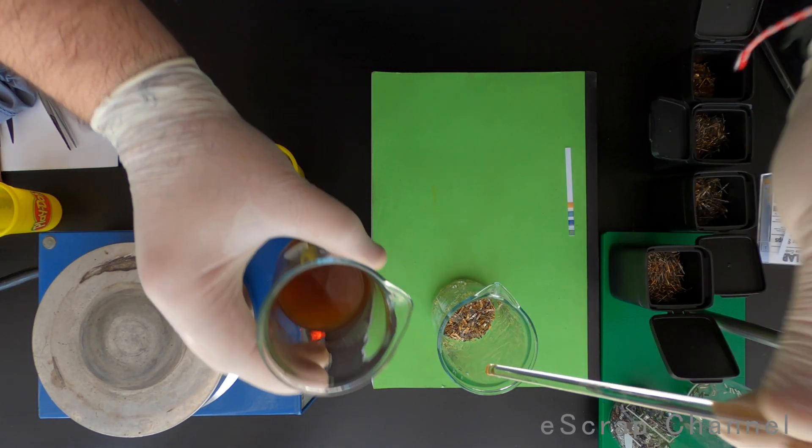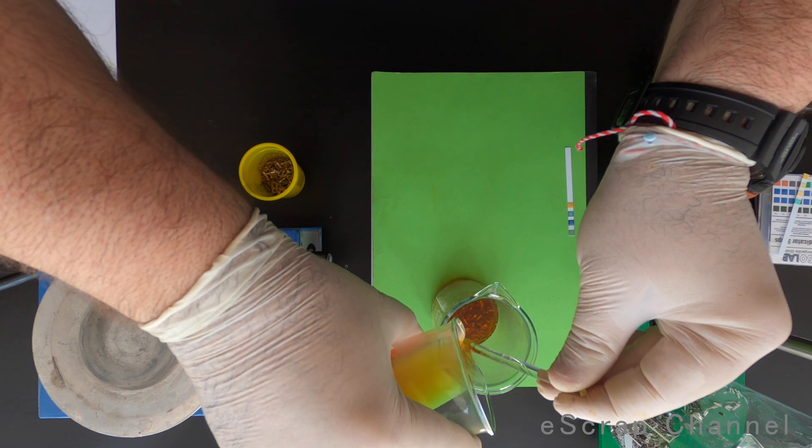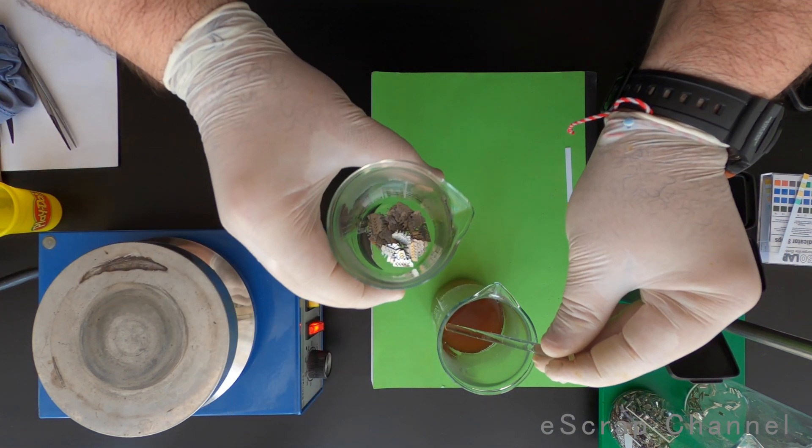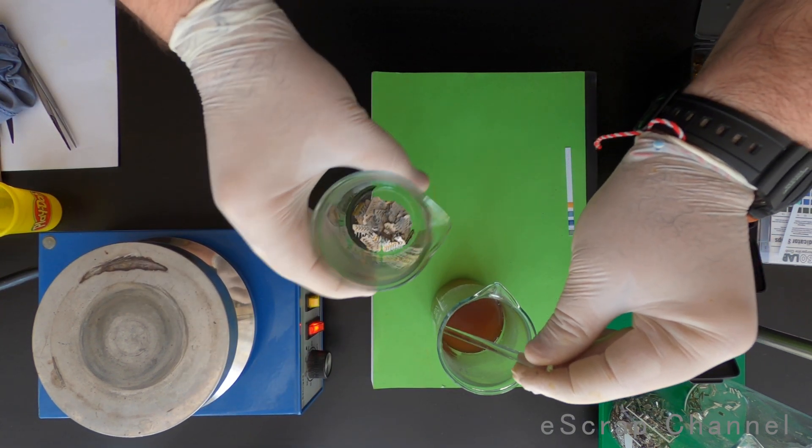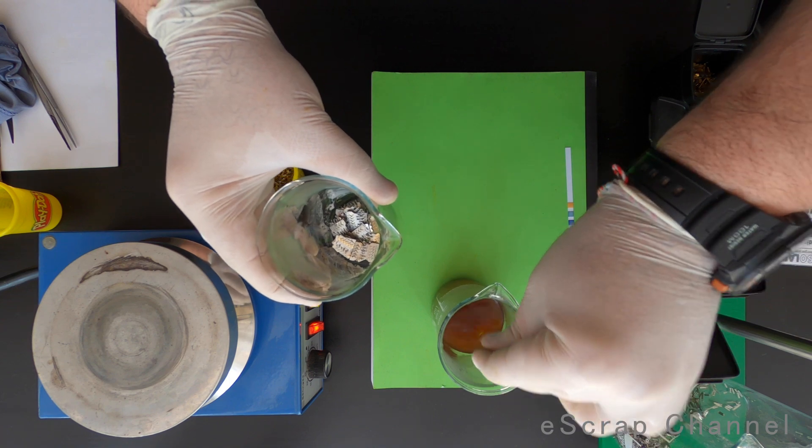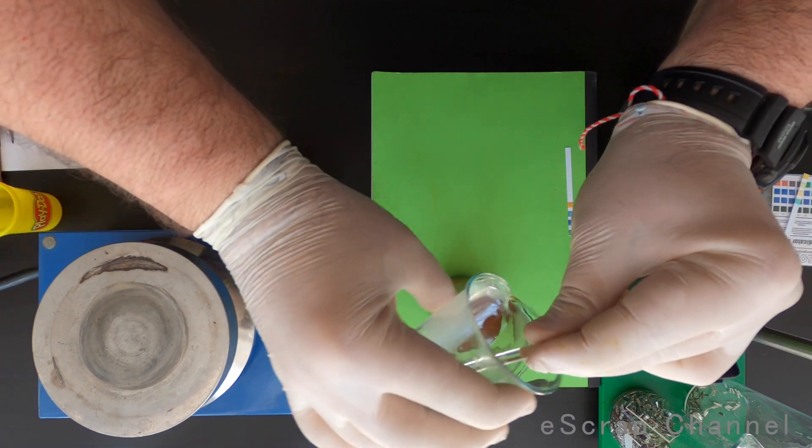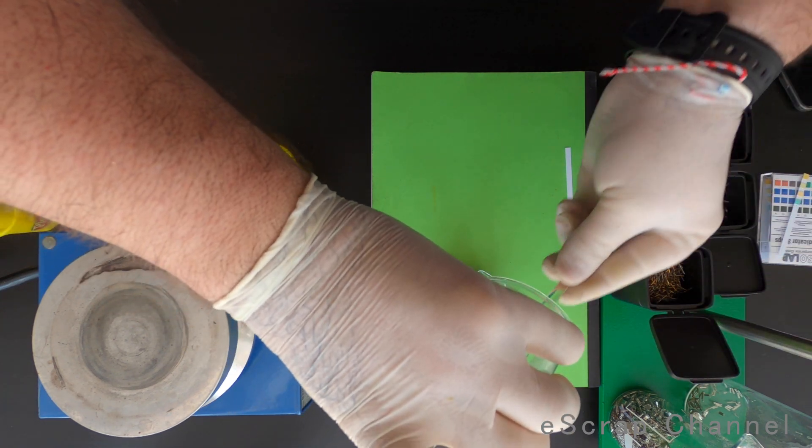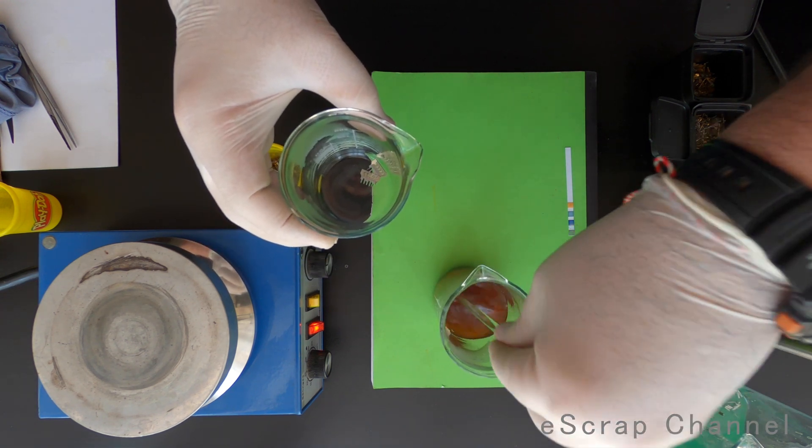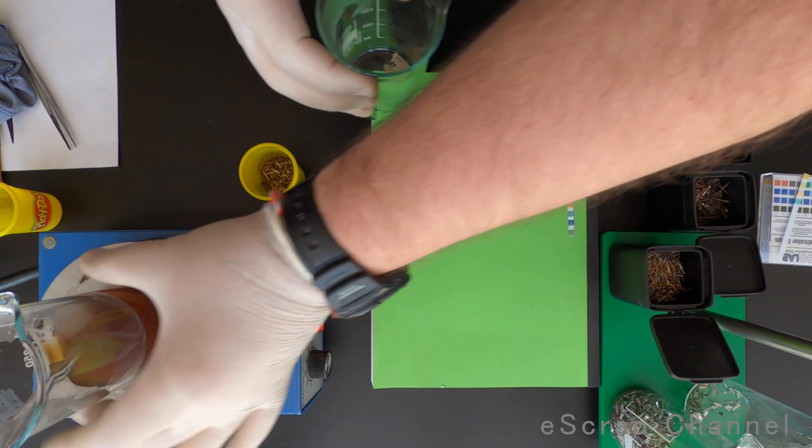We are ready for the next batch. Let's pour the solution inside and see what is left here. A little gold plating is left. Maybe I was too quick from my side. So what I will do now, I will add this here so they will be processed. I will return to the hot plate and let's see.